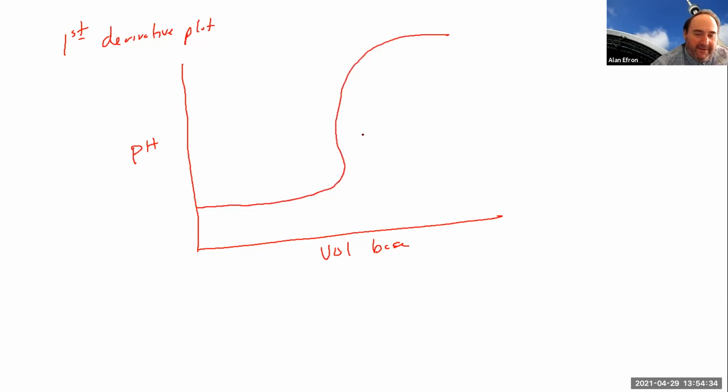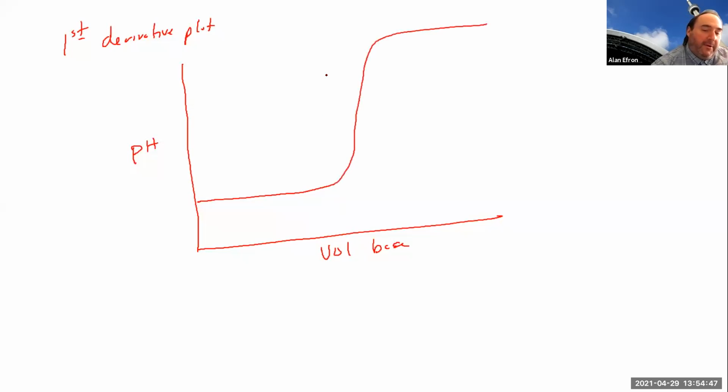So when you're all said and done, after you do the actual titration on the software, you make this graph. Very badly graphed there. Let's try that again. Maybe your graph will look like that. I don't know. It happens, I suppose. Maybe it's got that little. I'm not sure that's any better, but we'll go with it.